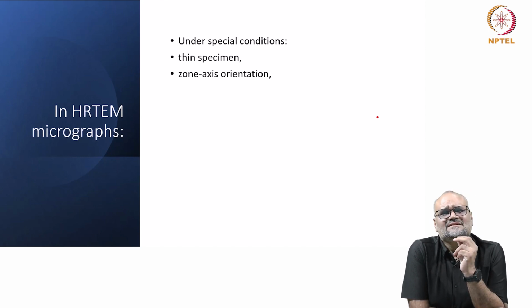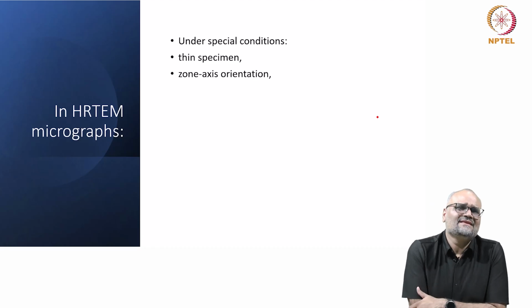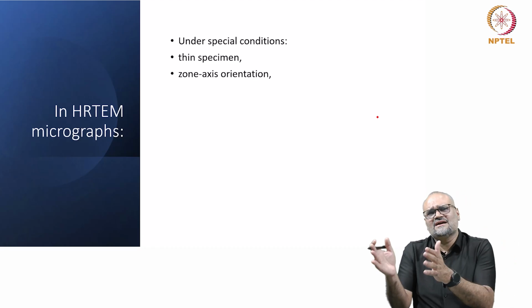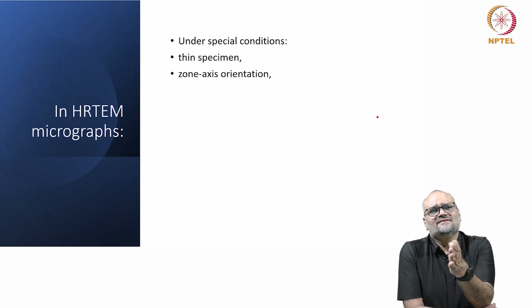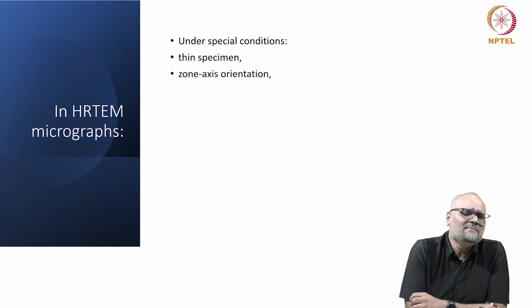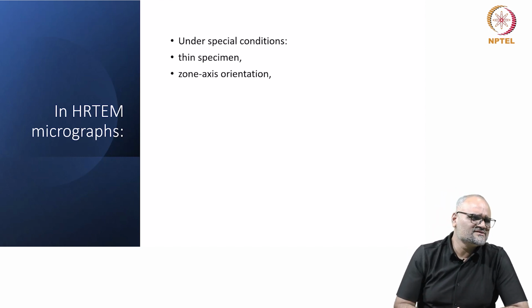This can give you sort of interference patterns which you would not exactly correlate or comprehend with how the real lattice fringes from periodically arranged atoms should look like. You might see that there is this extra half fringe kind of spacing which is appearing, or sometimes combining with the delocalization of information, you may see some strange artifacts that can appear in the micrographs as well.